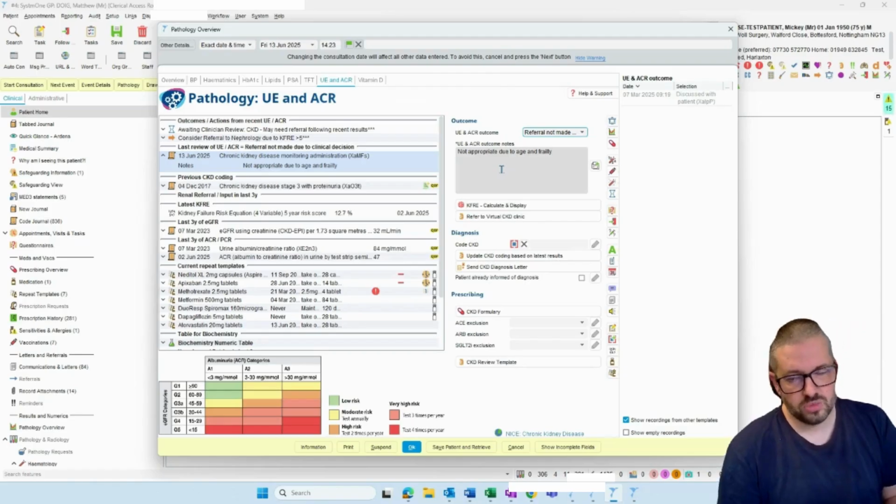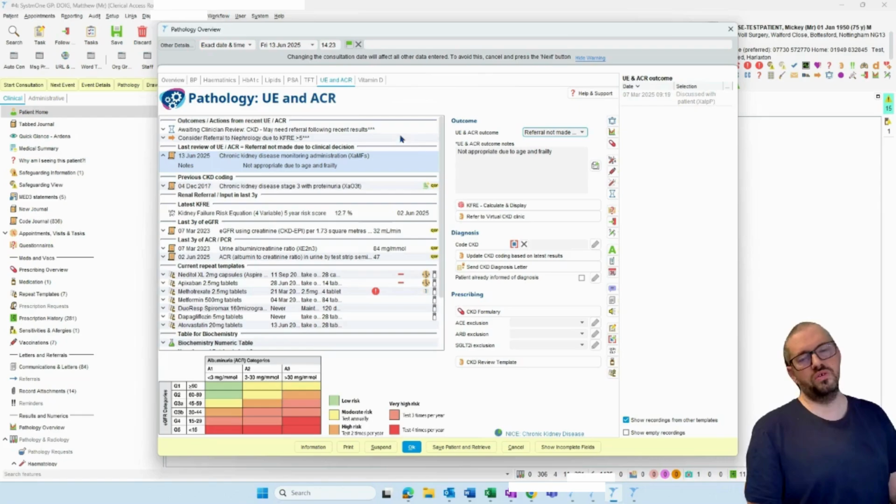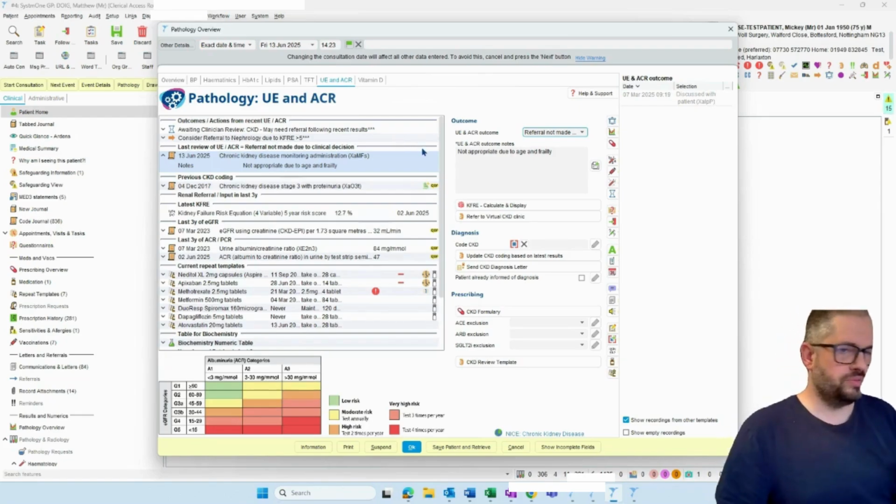We'll provide more detailed information about different pathways and so on, but we're trying to build it in a way that it works much the same for each result. So if you can get used to it for one result, it shouldn't be a great big shock to then start using it for another one.